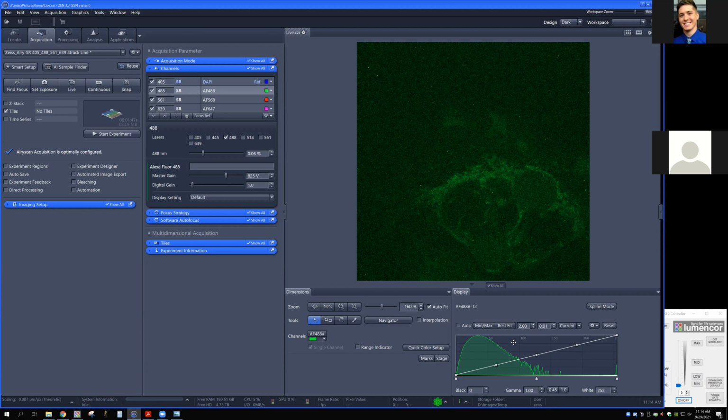It is basically deconvolution. There is a deconvolution step, the second step. I mean, we couldn't do it without the hardware and the setup that we have, but in post-processing, yes, there is a deconvolution step. There's a Sheppard summation and pixel reassignment, and in combination and in parallel, there is a Wiener filter deconvolution. We're not shy about that, but it's certainly not just deconvolution with a closed down pinhole or something like that.